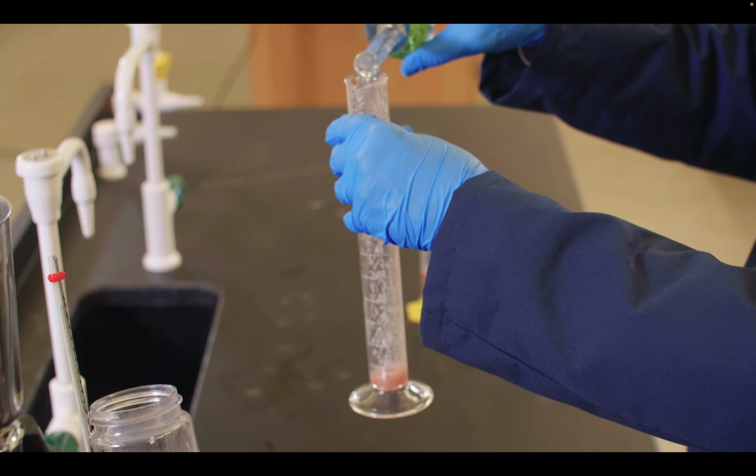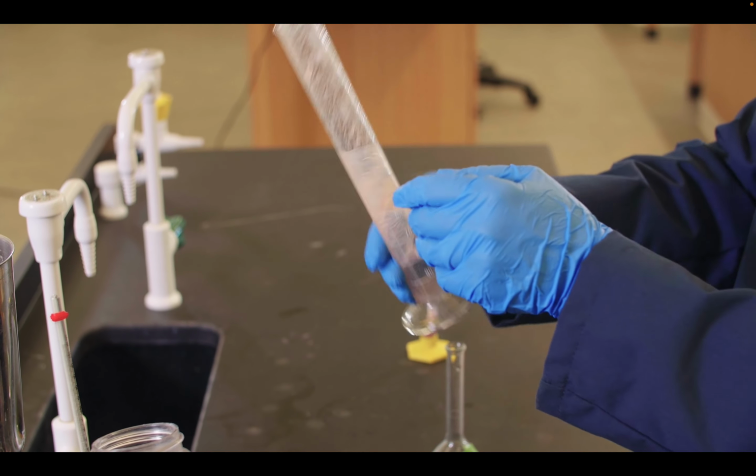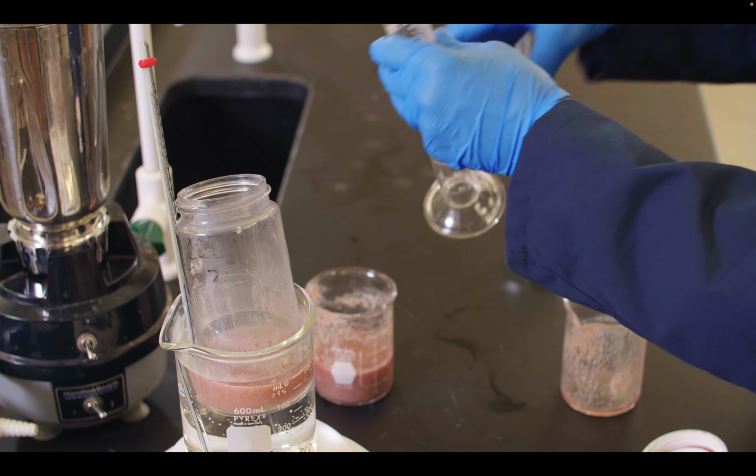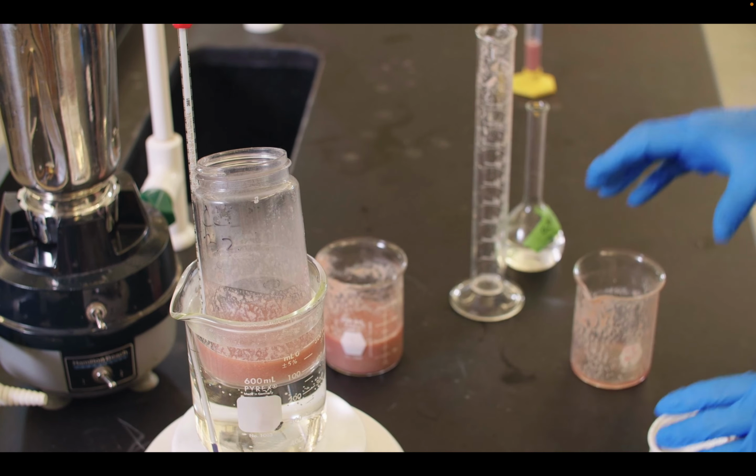All right, so we're going to just measure that. We want to get out any little remains that we can of the pig heart. Make sure we do this. We're going to measure out 15 milliliters. We're going to swirl it around, and then add alpha-ketoglutarate to here. Recall that alpha-ketoglutarate is going to heat stabilize the enzyme by forming the pyridoxal bond with it. And so it's going to give it a little bit higher stability, and as such, it won't denature.